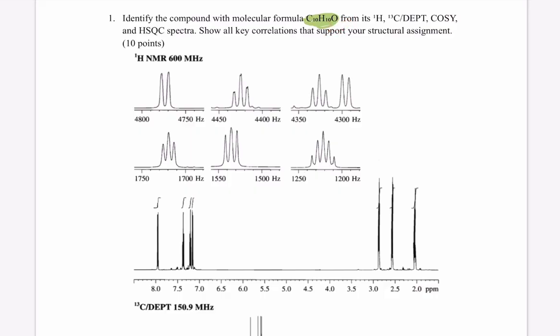formula. So using the molecular formula, let's apply the degrees of unsaturation formula to find how many degrees of unsaturation this compound has. So the formula for degrees of unsaturation is (2C plus 2 plus N minus H minus X) divided by 2. So that's going to be equivalent to, there are 10 carbons, so that's going to be 20, plus 2, there are no nitrogens, so that's 0. There are no halogens as well, but there are 10 hydrogens, and this is going to be 0.